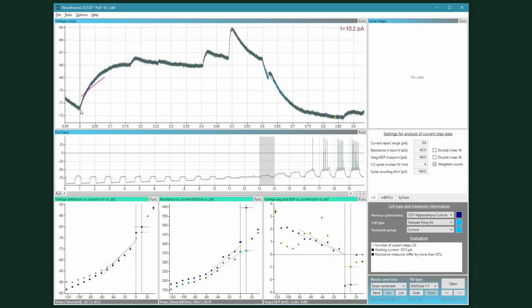We can see that the membrane potential rises smoothly, and then it should probably just flatten or smooth out, but then there is this point here. So we can see that this is not the true maximum voltage deflection of the cell, but something that the EPSP caused. So how to help the program to deal with this little problem?